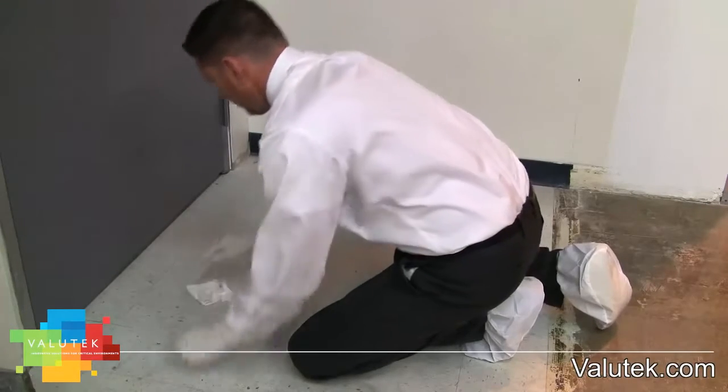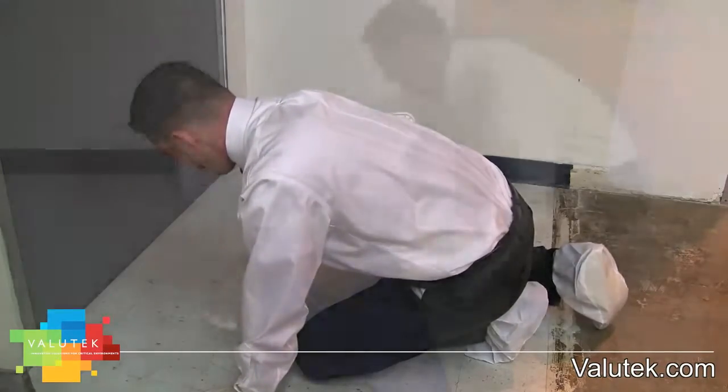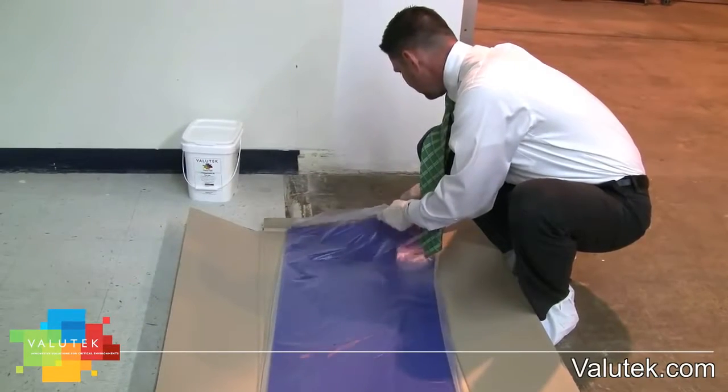Clean the surface thoroughly, checking for residual adhesive from a previous mat. Any dirt or residual adhesive will cause the mat to adhere unevenly. Adhesive mat frames can be used to ensure the surface they are placed on is clean and smooth.